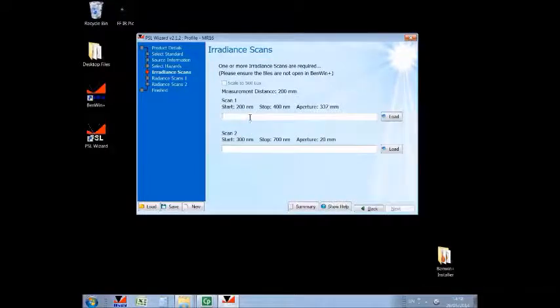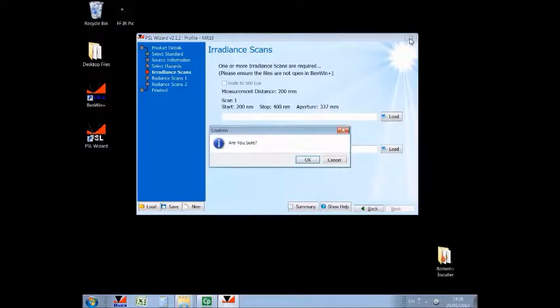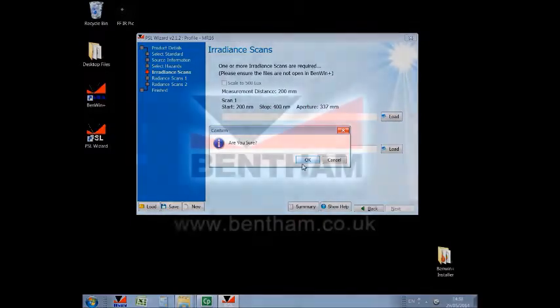In practice, and although this may be slightly unnecessary, I tend to recommend simply doing the full measurement 200 to 1100, 200 to 1100 in all cases. And in that way, one need not have an innumerable number of custom wavelength files to ensure that we have the correct step size throughout the range, corresponding to that with which the system was calibrated. And that is the PSL Wizard.